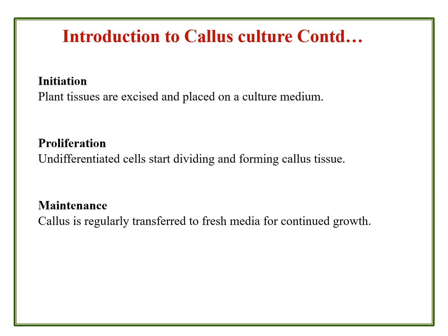If any browning occurs, or orange-red color, or black color occurs, immediately the culture bottles or test tubes must be removed from the racks or culture maintenance room. Otherwise the other cultures will be contaminated very soon.